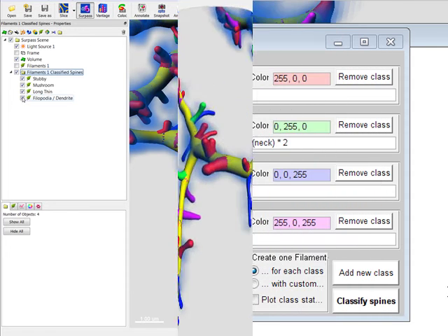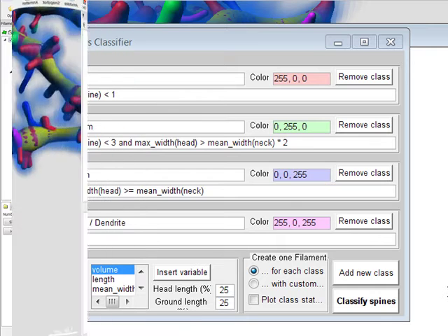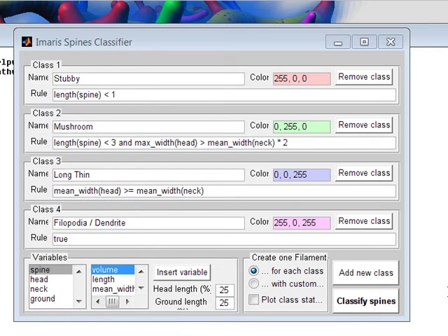Spines can be classified using the default rules, or alternatively, you may create your own classification rules based on your actual data. In the dataset, you can measure the relevant spine and use these parameters for setting your own classification rules.